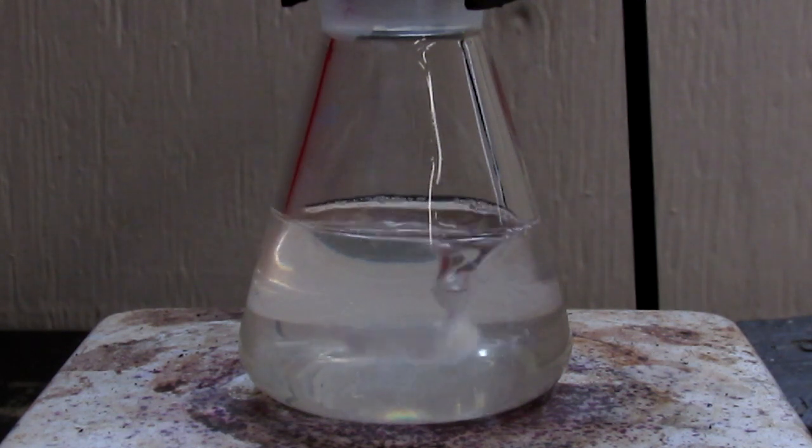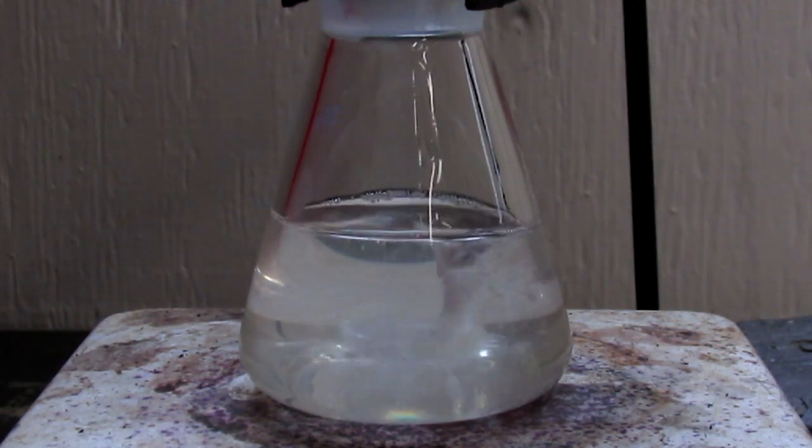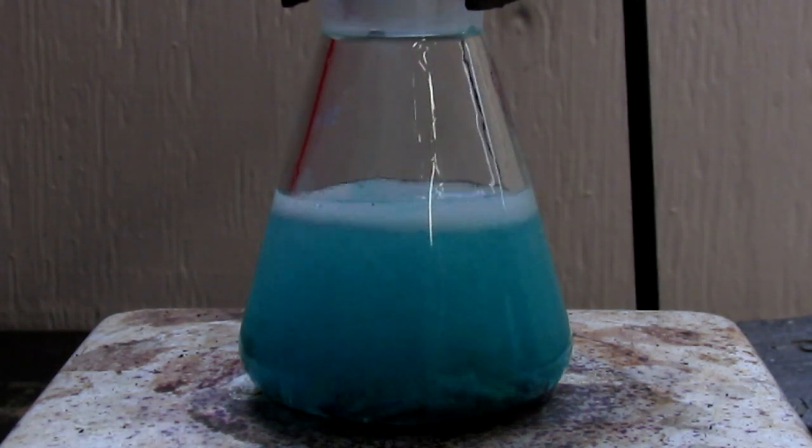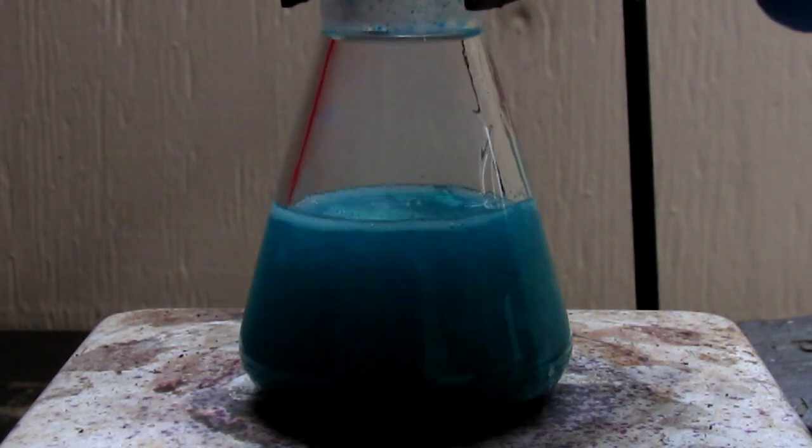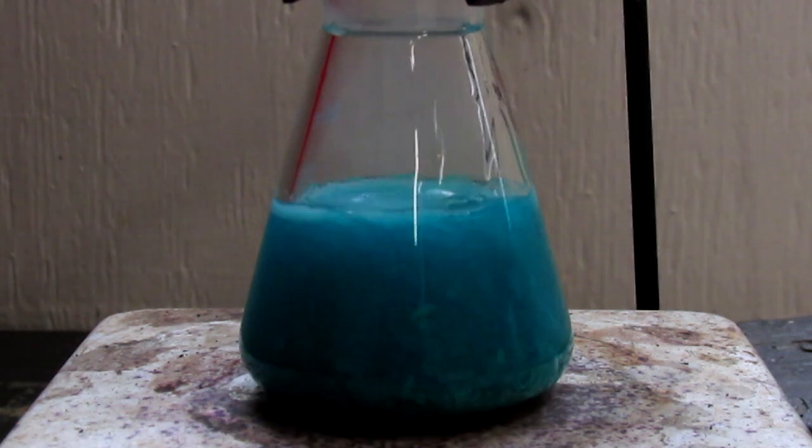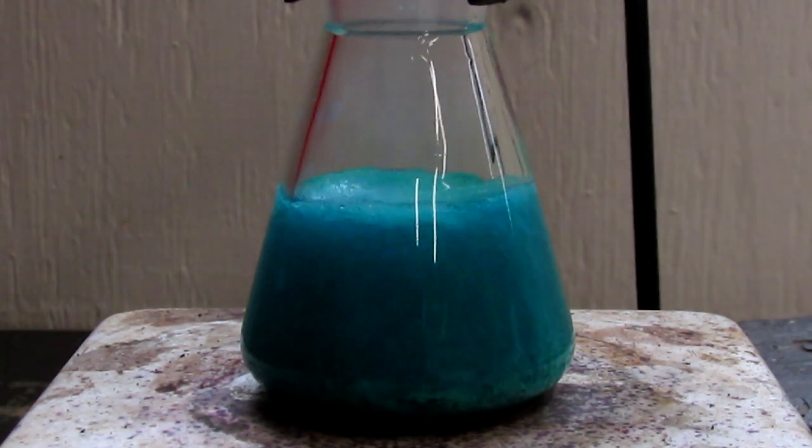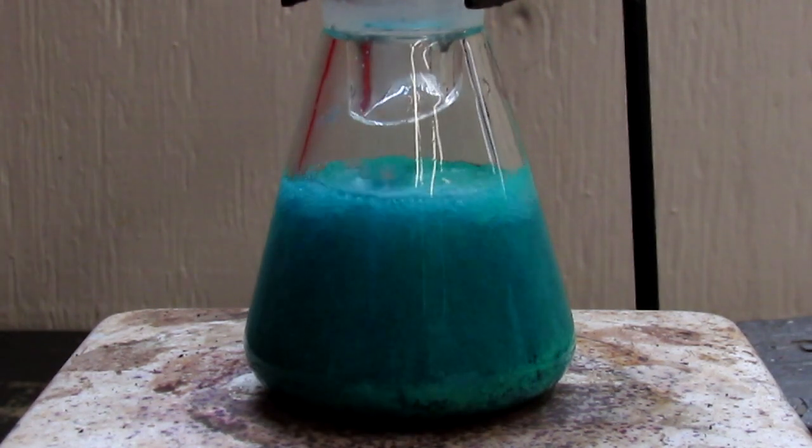The triphenylphosphine is now dissolved, so I'm going to dump in the anhydrous cobalt bromide. You should see a nice color change happen. Very emerald green precipitate. And then I'll throw the condenser back on and let that reflux for 20 minutes.